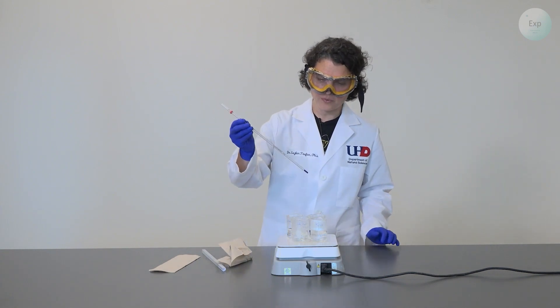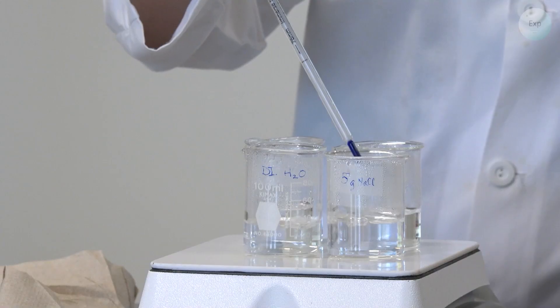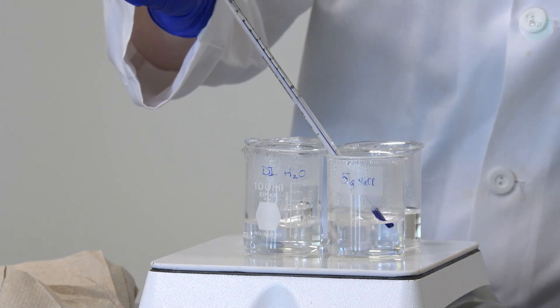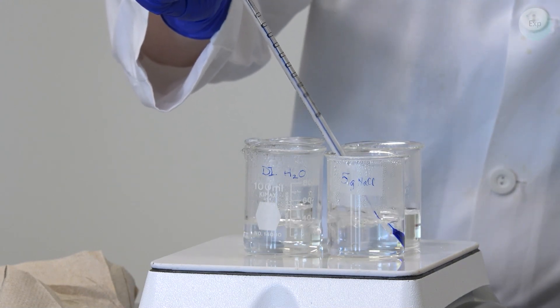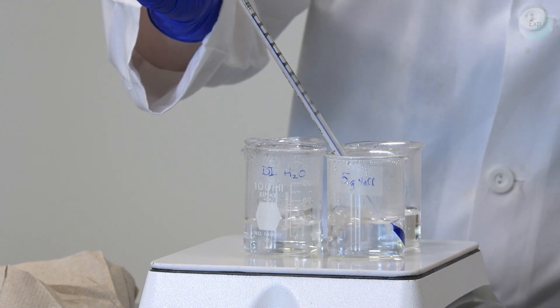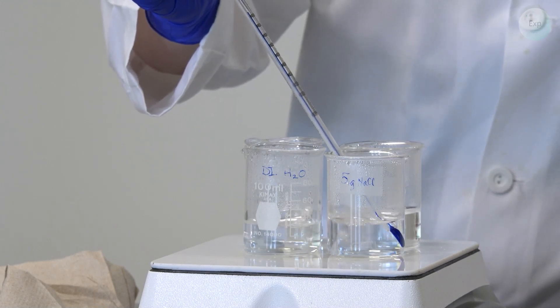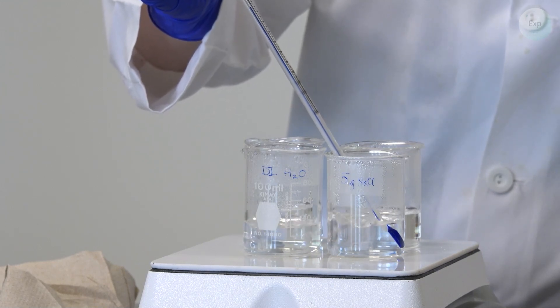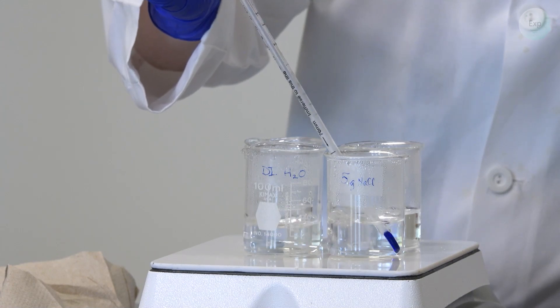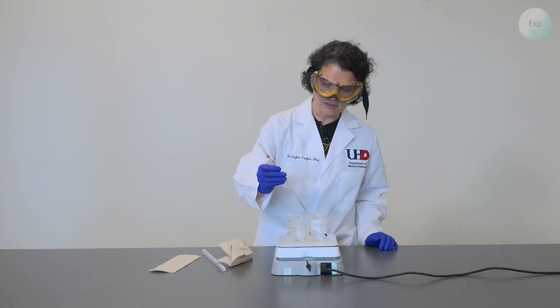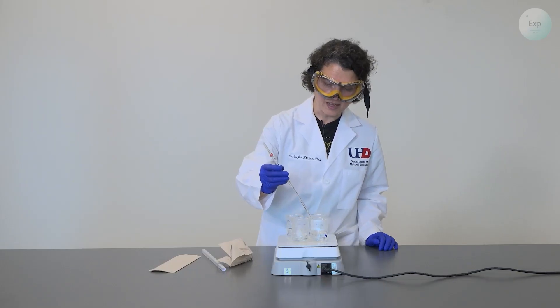Then move the thermometer into our first solution that contains the five grams of sodium chloride. We follow the same process. Insert the bulb of the thermometer inside the solution, but don't touch the bottom of the beaker. Then leave it there for at least a minute until the temperature goes as high as it can.